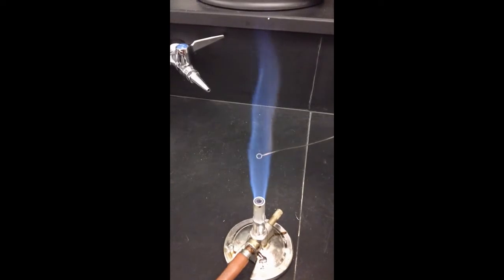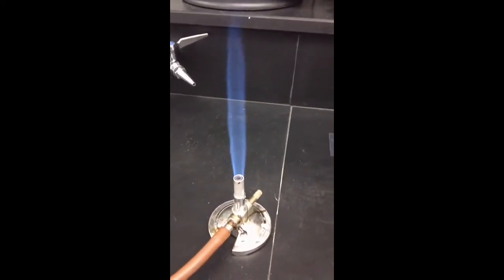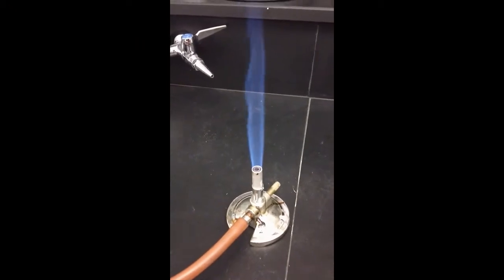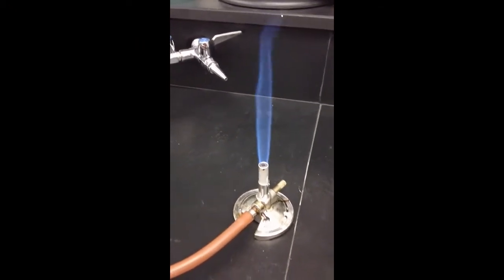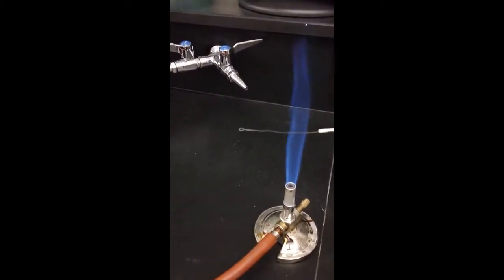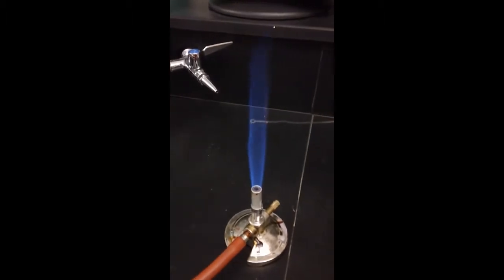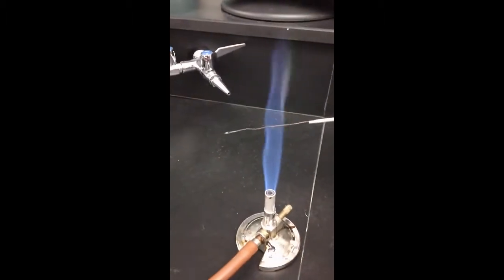Oh, notice that. There are little sparks there. Okay. So that was CR. Then I'm going to make sure it's nice and clean for my next chemical. Oh, see how we have some on there? Make sure it's nice and clean.